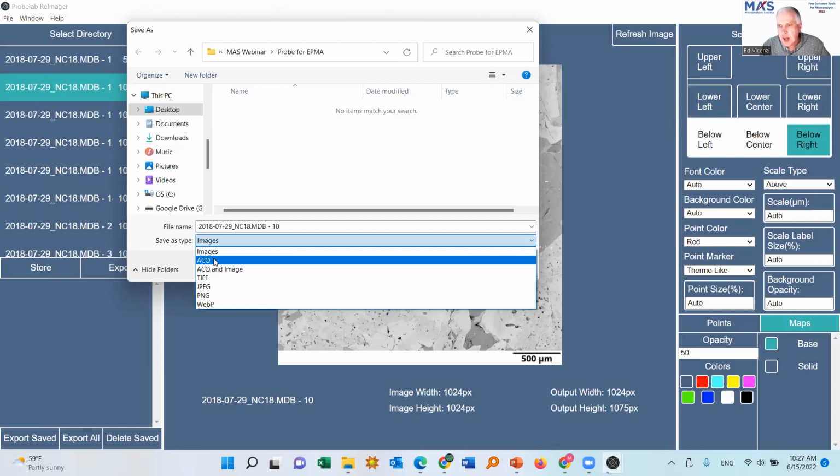Belusic is also asking, will it import 16-bit TIFF images? Oh God, that's such a good question. And if Mia would be here, she would know that. I don't know if there's a difference for, like, I would say both, but I don't. I would guess that it does, yeah. But Mia can confirm, yes.